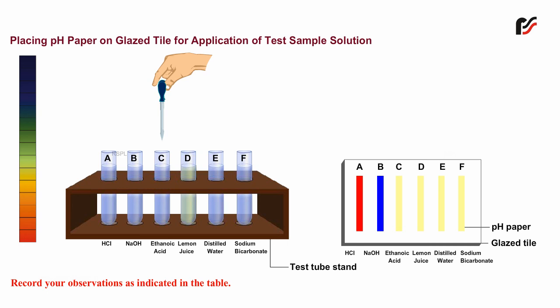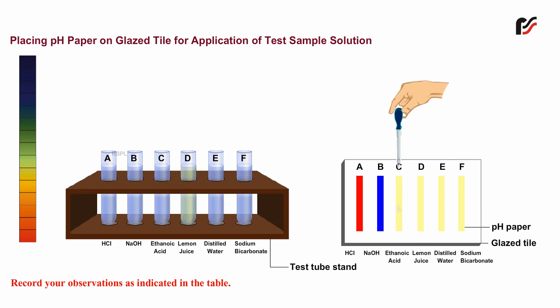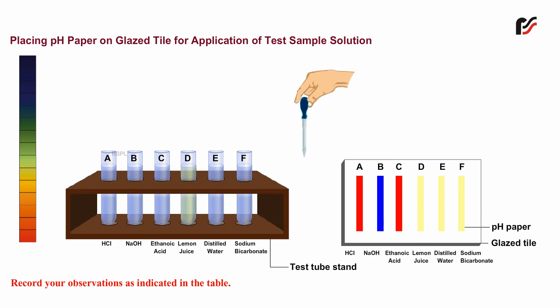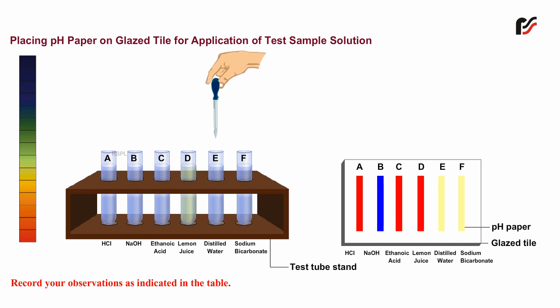On adding the next sample, the pH paper turns red, giving a pH equal to 3.0 — the solution is acidic in nature. On adding the following sample, the pH paper turns red, giving a pH equal to 2.0 — the solution is acidic in nature.